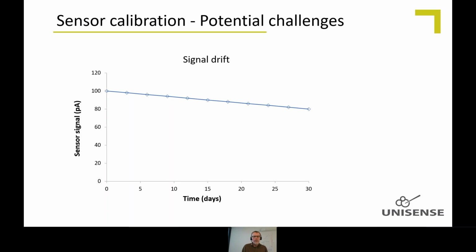It may be linear, or it may have a different shape. We don't quite know, and it depends on the individual sensor, since they are handmade, so they are very individualistic. But the drift is so low that it's not a problem at all. You just need to calibrate now and then, especially if you're working in profiles within a few hours, whereas here we're talking about a month or so. It's just something you should be aware of and do calibrations.